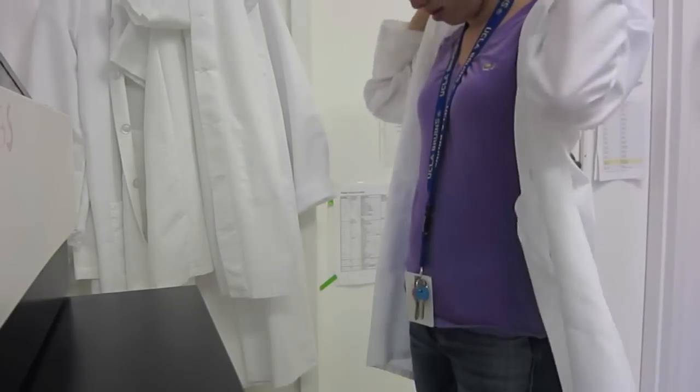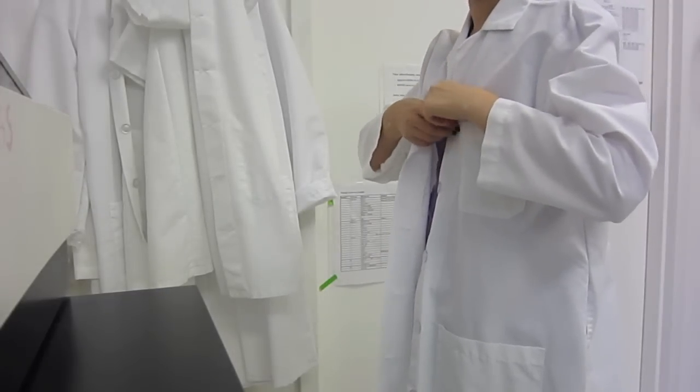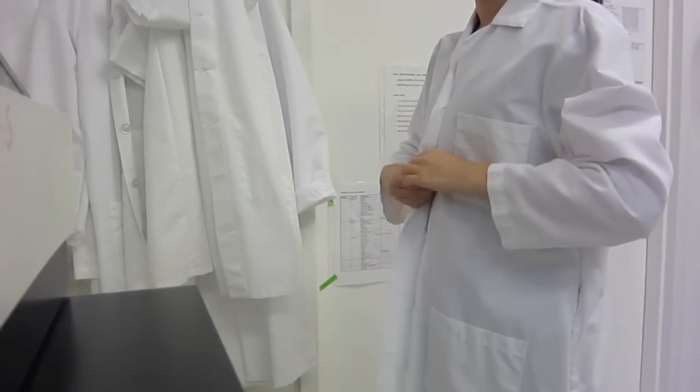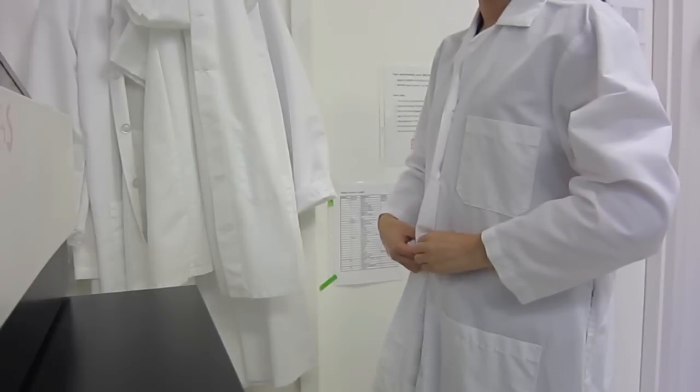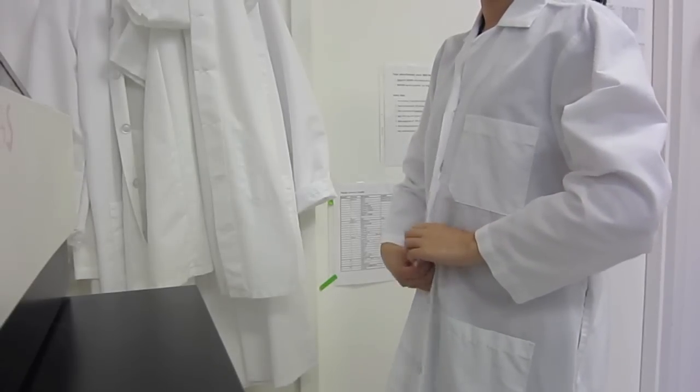Lab coats should not be removed from the tissue culture room and should be changed and washed every few weeks. Please check with your principal investigator for any additional personal protective equipment and review the material data safety sheets for any reagents that you are planning to use.